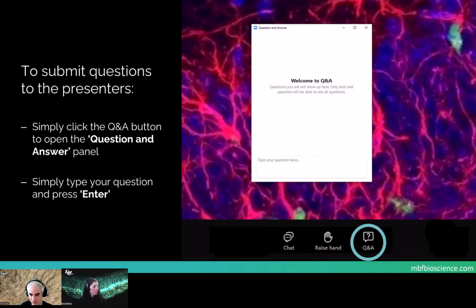Obviously, the size of the particle might influence the detection. What we've been training the software for is cells, so think about from 4 to 30 microns in size. But just to make sure that people understand this, with this software you're getting estimation of cells, not level of expression like intensity, like what you're getting from some colorimetric analysis or RNAscope analysis. Okay, I think that is all the questions.